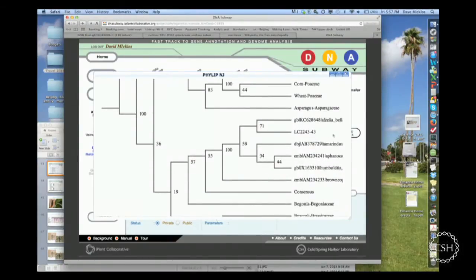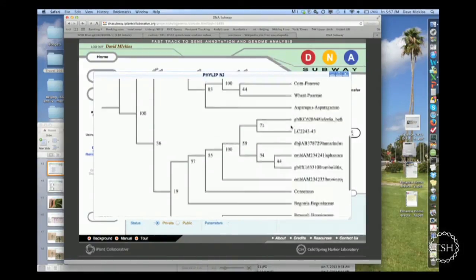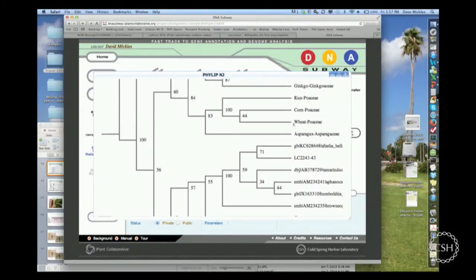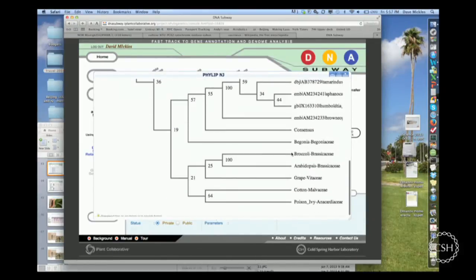they've shaken out there. And you'll see that at least of the things we have here, the begonia is the closest, most closely related of the common plants here. Of course, these are monocots over here, so we can understand that they're not closely related.